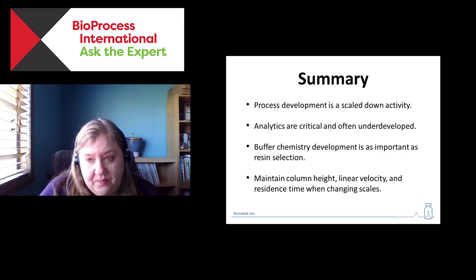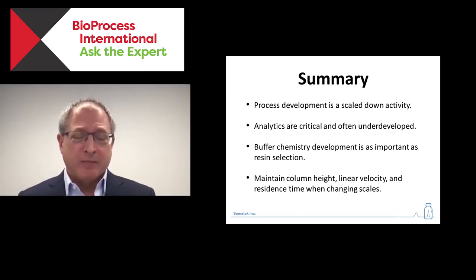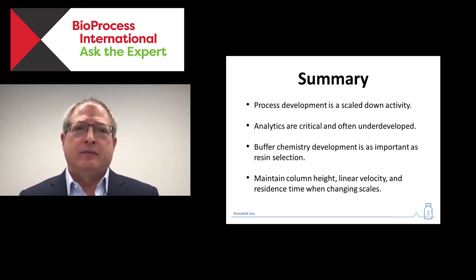In this particular case, we were operating at a pH of 7.5, I believe. In general, with a virus like this, you do need to avoid strong acids. And in general, most people are using, and so are we, pHs between 6 and 8.5.